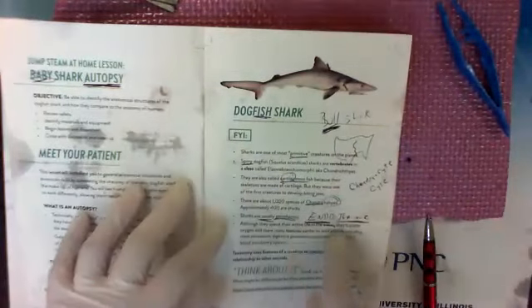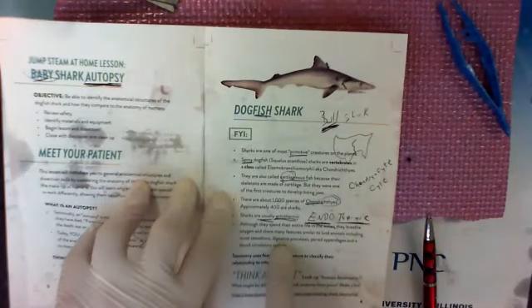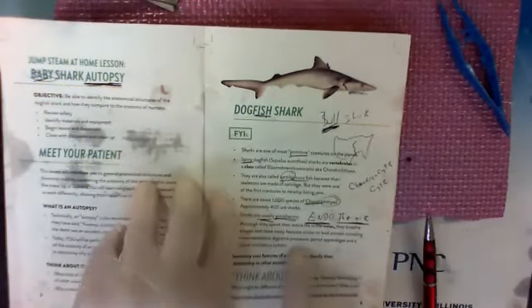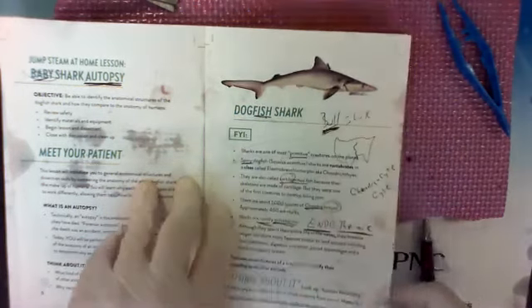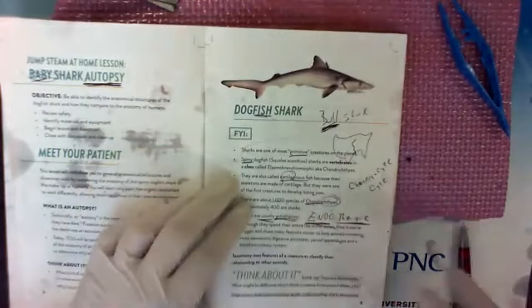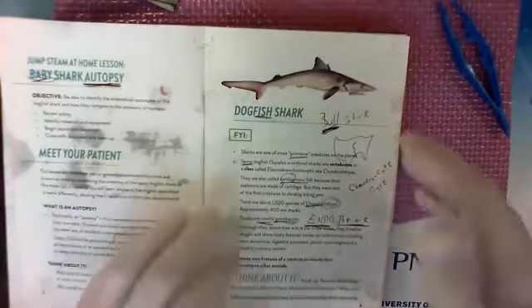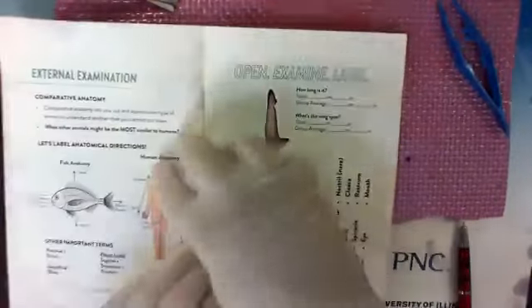So we'll compare the similarities, like breathing and how they breathe. We'll talk about their body structure, like paired appendages, like we have arms and legs, 2 of each. They have fins that work similarly. Digestive process: how they eat their food, process it, and how it's like us and how it's different. And if you want to see how closely related we are, Google taxonomy of shark and human, and there are a lot of web pages that show you how far away we are based on all the species out on the planet. Kind of fun.